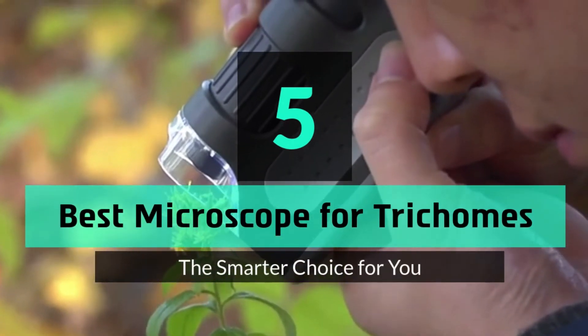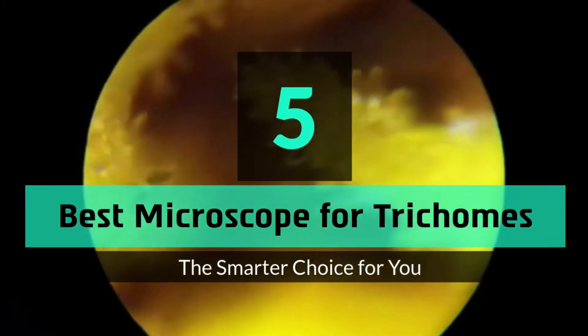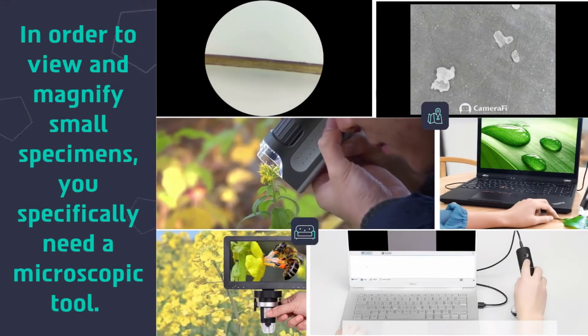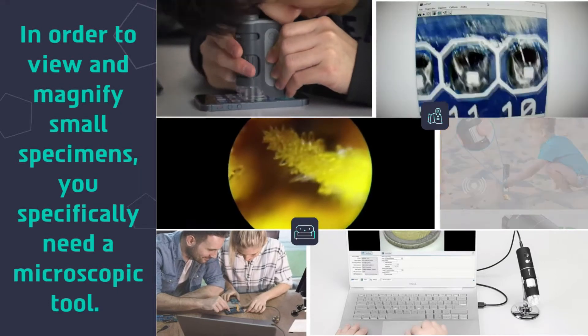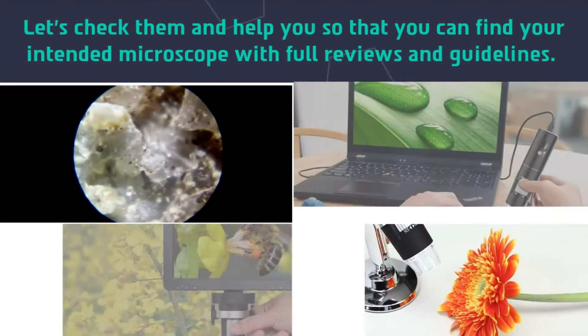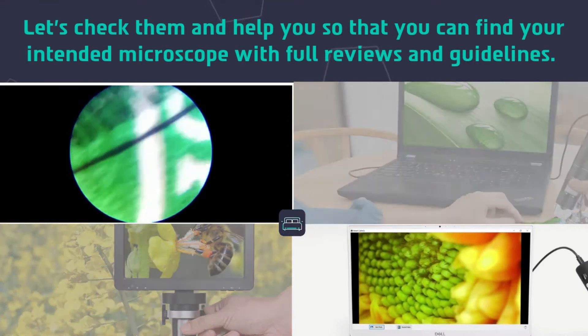5 Best Microscopes for Trichomes. In order to view and magnify small specimens, you specifically need a microscopic tool. Let's check them and help you find your intended microscope with full reviews and guidelines.